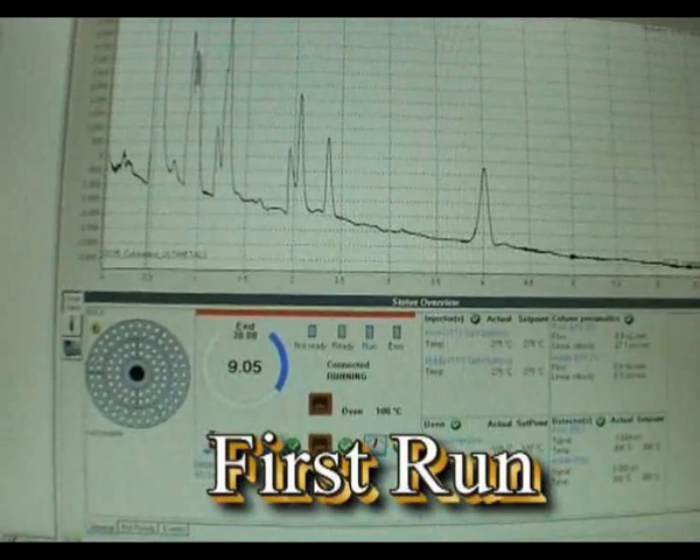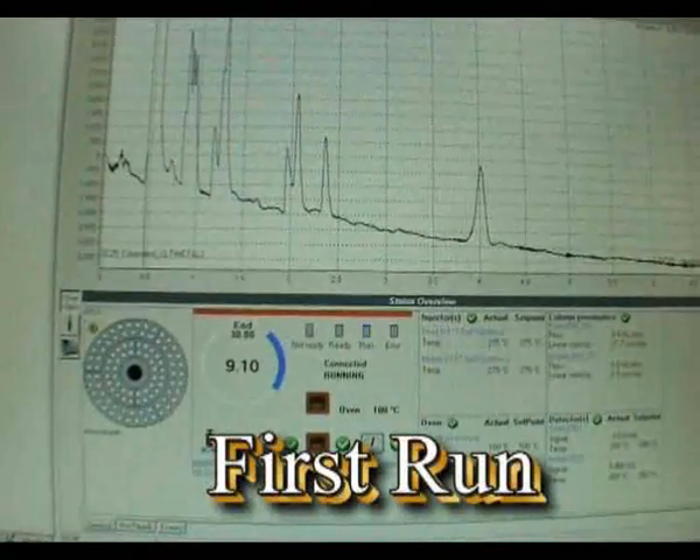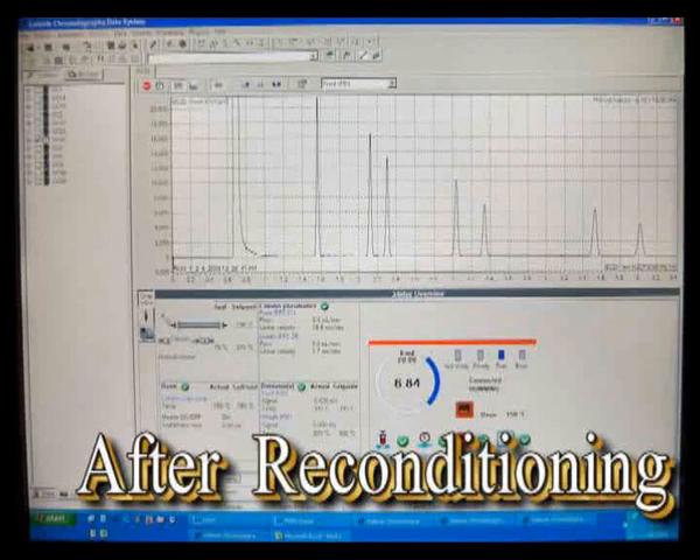Without any conditioning, this is what the chromatography looks like. Not bad, but we can do even better. After 16 hours conditioning at 350 degrees, the chromatography is great.